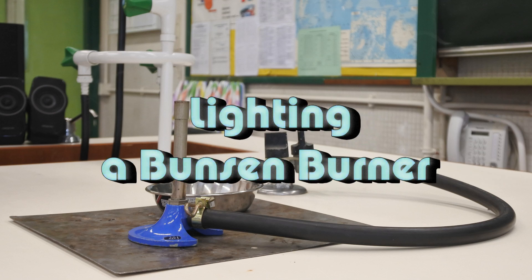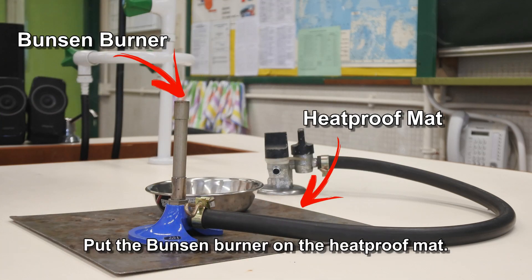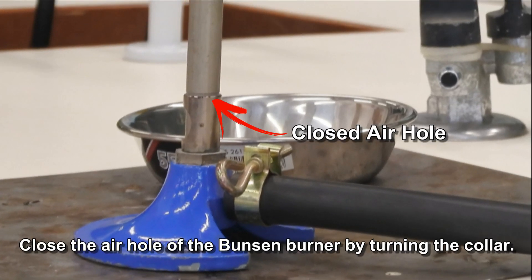Lighting a Bunsen burner. Put the Bunsen burner on the heatproof mat. Close the air hole of the Bunsen burner by turning the collar.